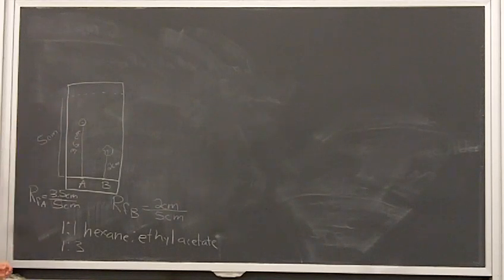Okay? And usually with TLC, you don't develop compounds in just hexane, or just ethyl acetate. You have a combination of a nonpolar and a polar solvent to help with the polarity of whatever you are looking at.